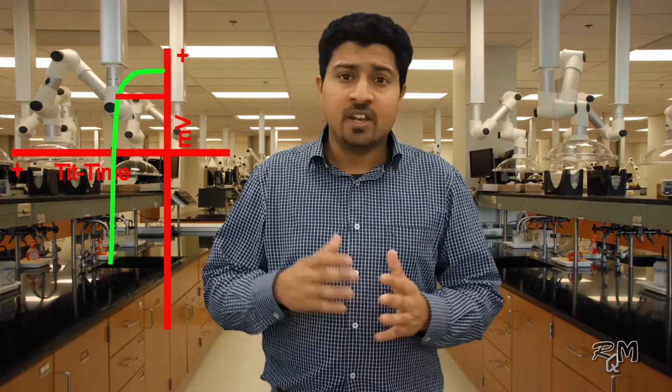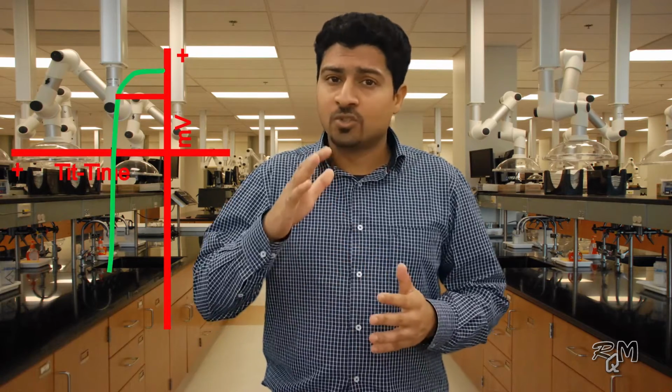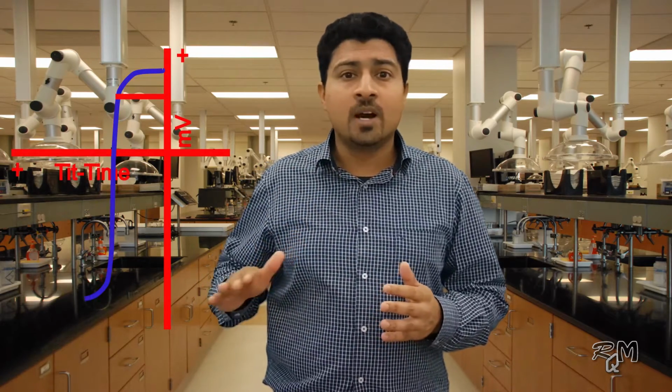Then you will see the rate of change of millivolt reading start to slow down. And one point will come when this millivolt reading becomes constant. Now I will show this to you in real time.